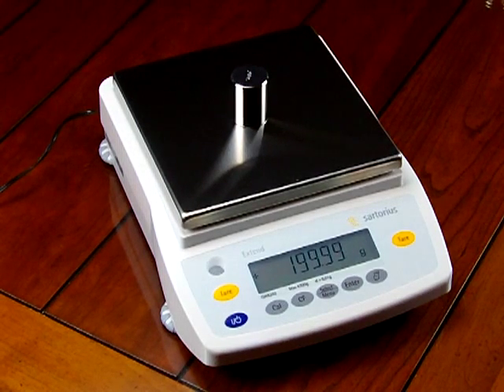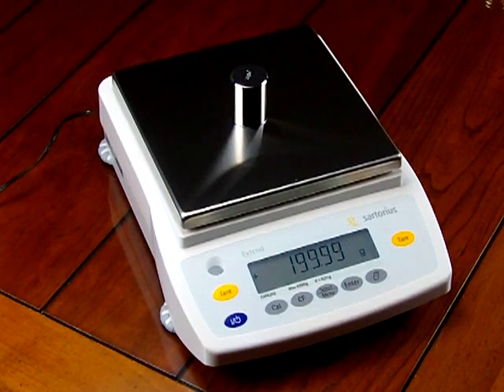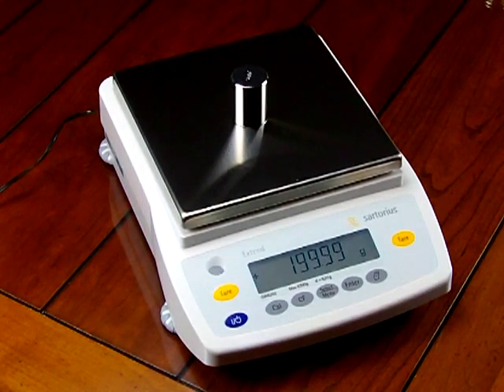Sartorius is using a monolithic cell and it offers spectacular performance. When people call asking what is the best balance, you really want to consider the brand name. Sartorius has been building balances for over 140 years, starting in 1871 when they first introduced the first pharmacy balance. They've led the weighing industry in innovation for laboratory, jewelry, and industrial weighing applications.